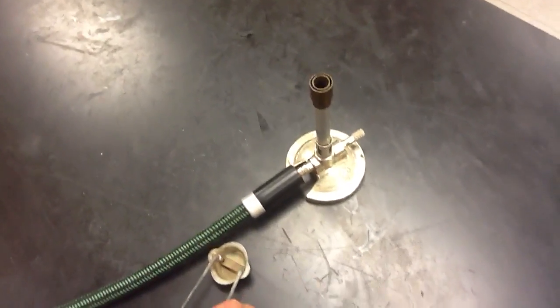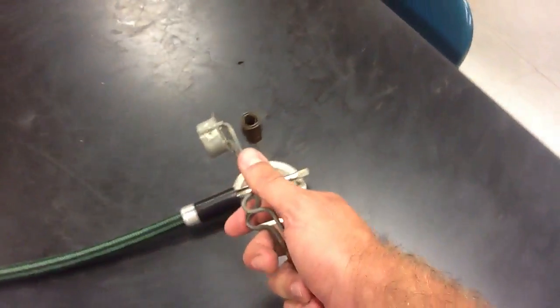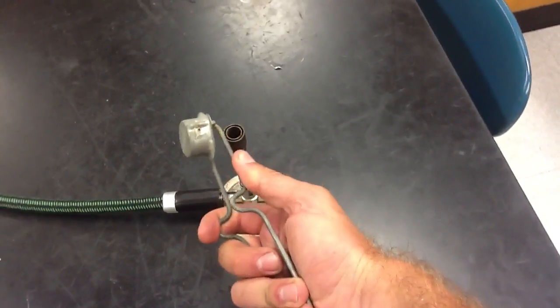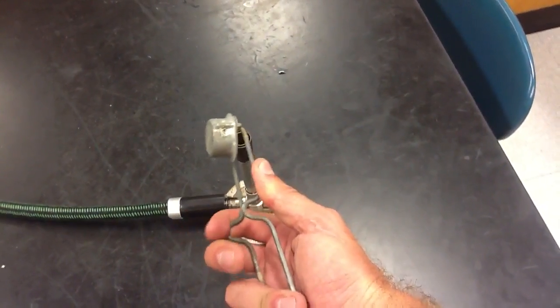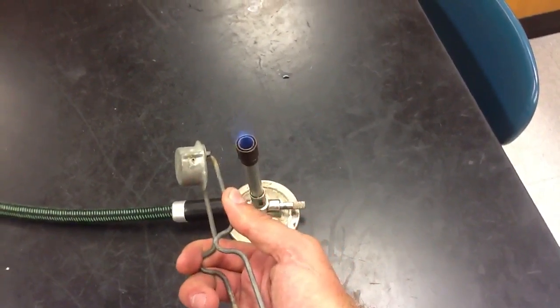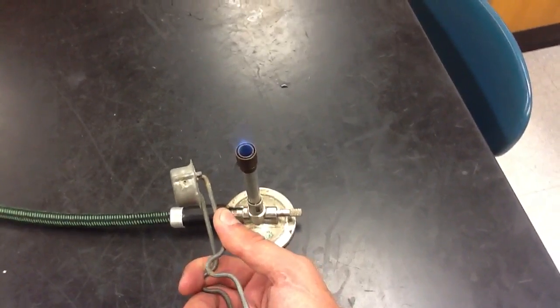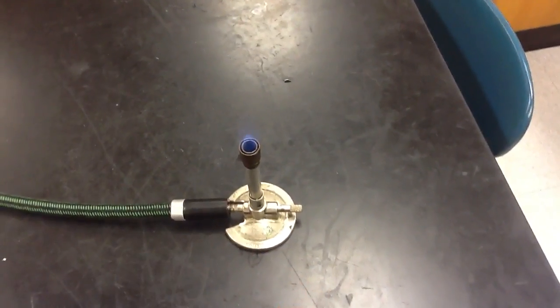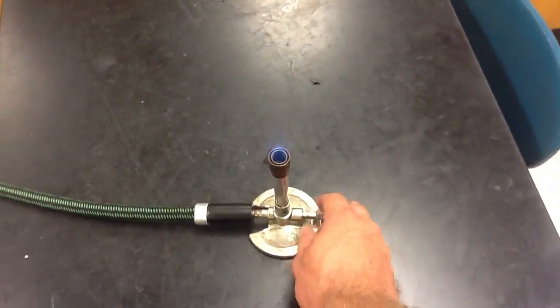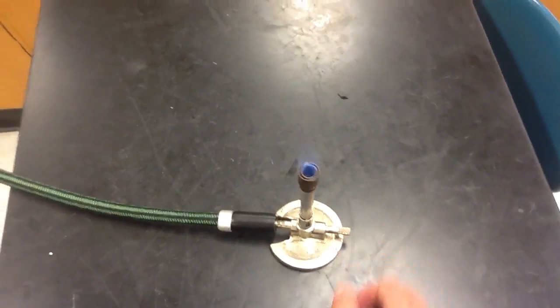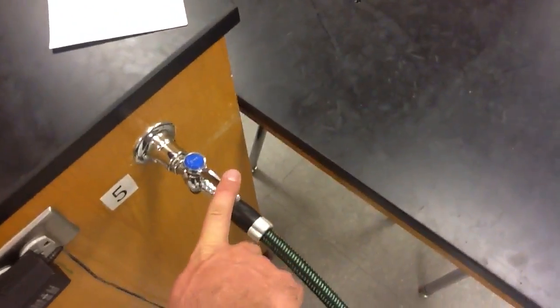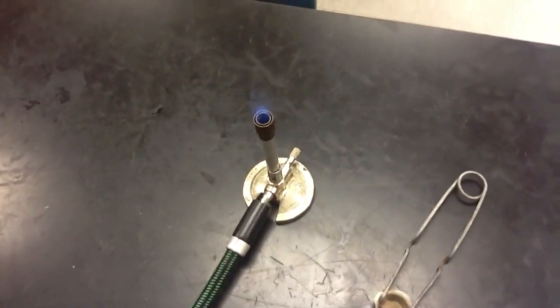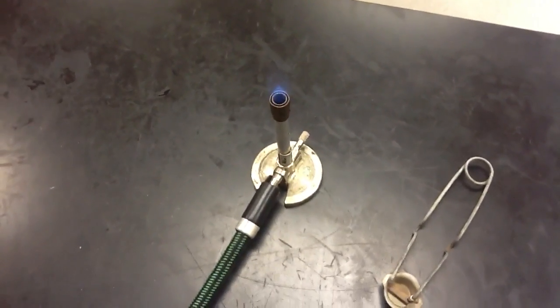Next thing you want to do is grab your striker. Turn it to the side a little bit next to the burner. Push down and across until you have the light. Once it's lit, you can adjust it here or over here. Now that it's lit, you can do what you need to do with the burner in your experiment.